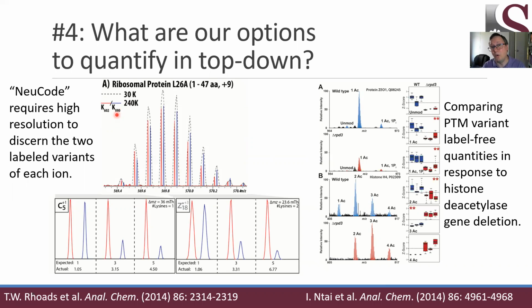And the answer is no. They have different energies of adding in the neutrons in hydrogen versus the other elements. As a result, in this case, we are looking at an intact peptide that's charged +9, and our range here is only from 569.4 to 570.4. In other words, from here to here is a single m/z unit.